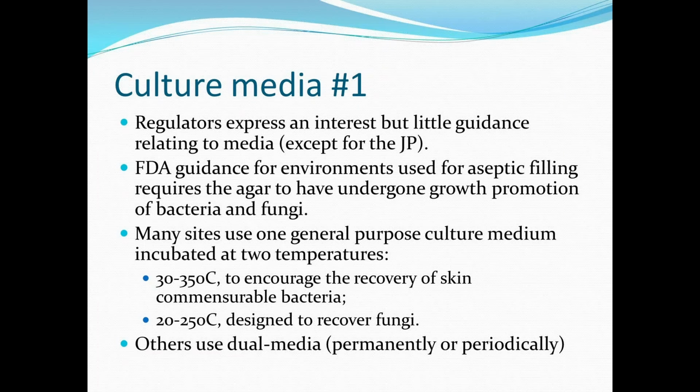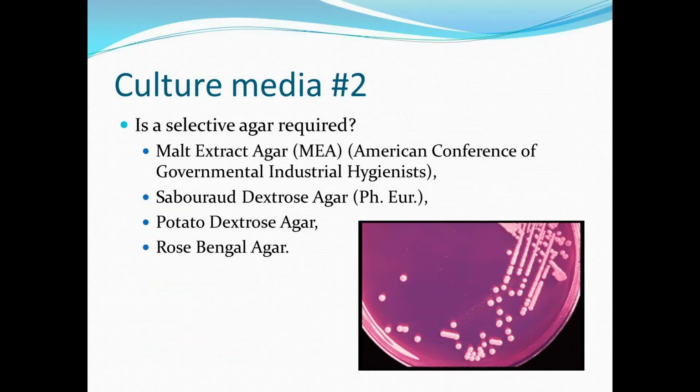Other sites choose to use two different media. A big limitation in relation to fungi relates to the culture media types used, and the incubations.